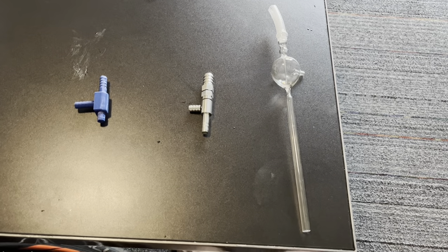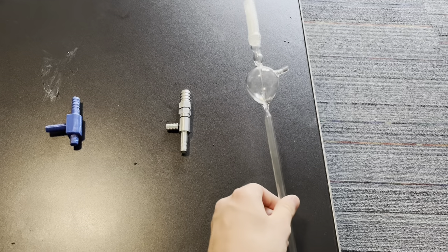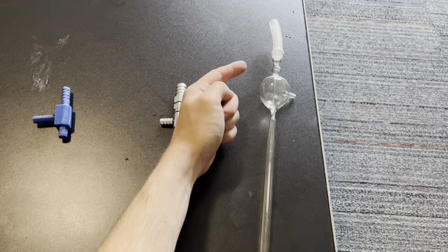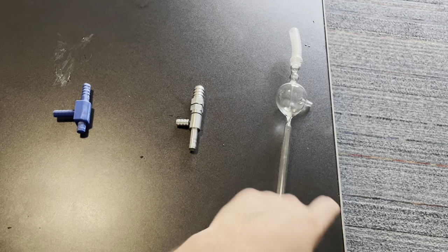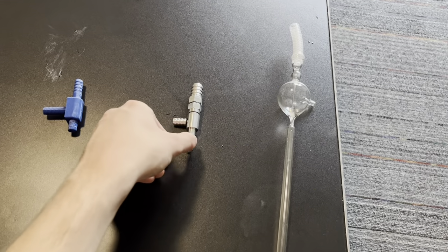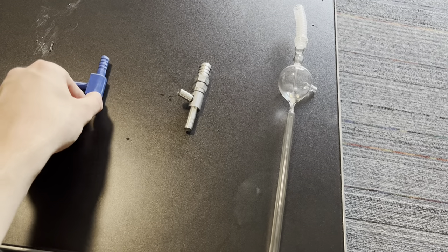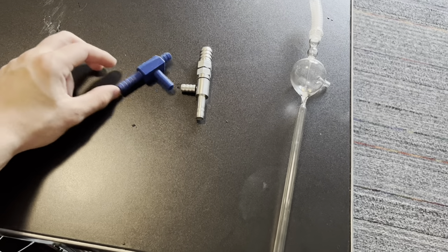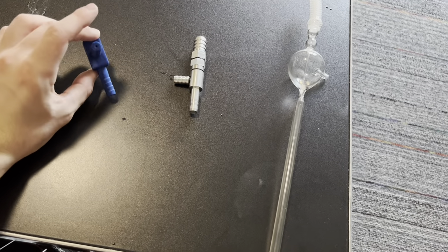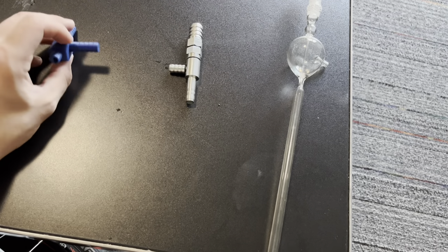I will also go over these three different types of water aspirators, including this glass water aspirator, which can be useful if you're working with some sort of corrosive compounds but can also be a little bit more expensive, costing around $30, whereas the other ones were about $10. This is a metal water aspirator — the standard model — and this is a 3D printed model of the metal water aspirator. I think all of them could potentially work out, but I will explain later in the video why I ended up going with the metal water aspirator.